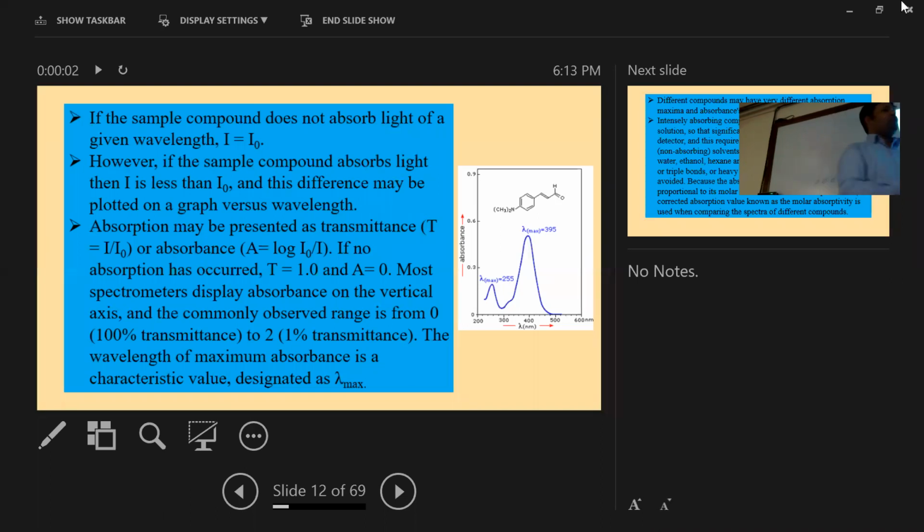And then we do the scanning electron microscope. Have you ever heard the name? SEM, scanning electron microscope, and also TEM, transmission electron microscope. Those are very expensive instruments. We cannot see any nanoparticle around 10 nanometer by eye.